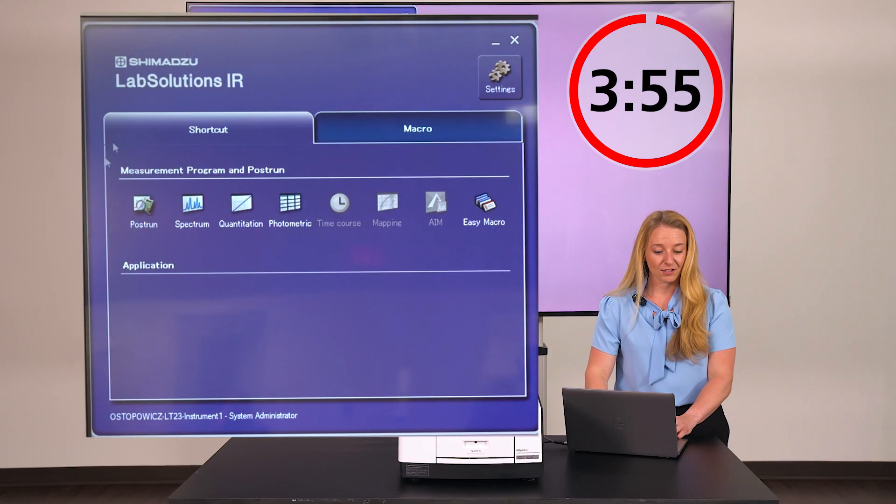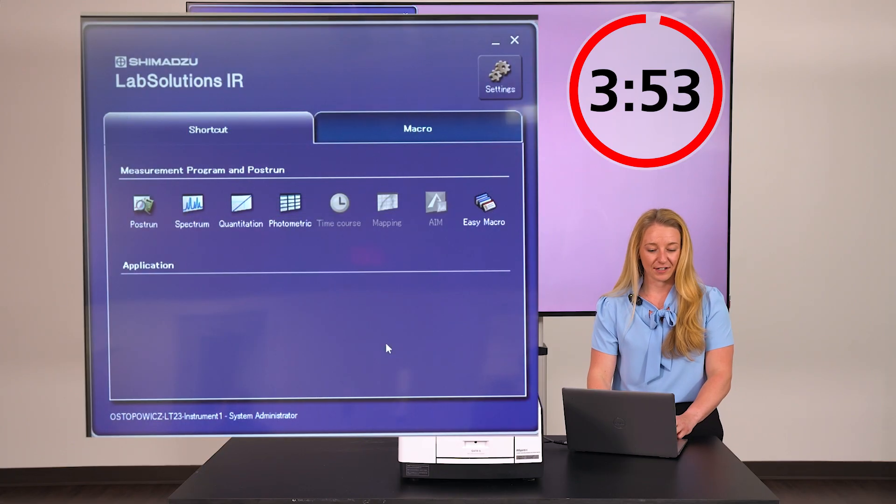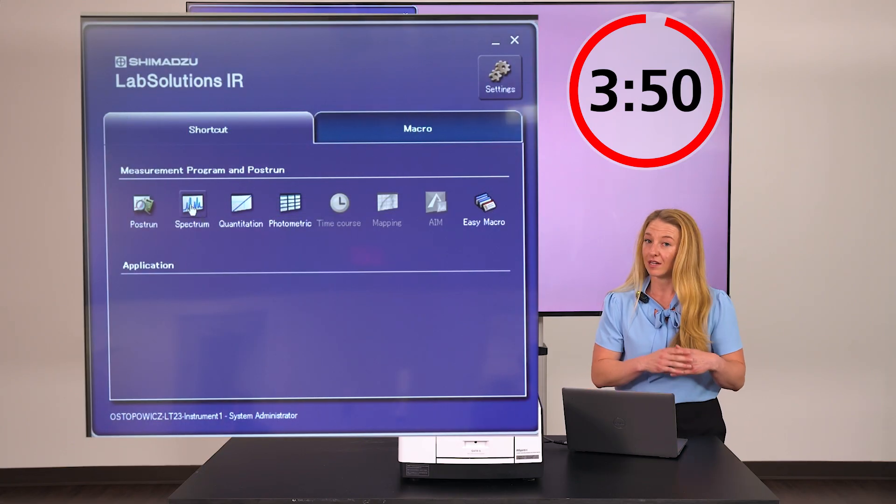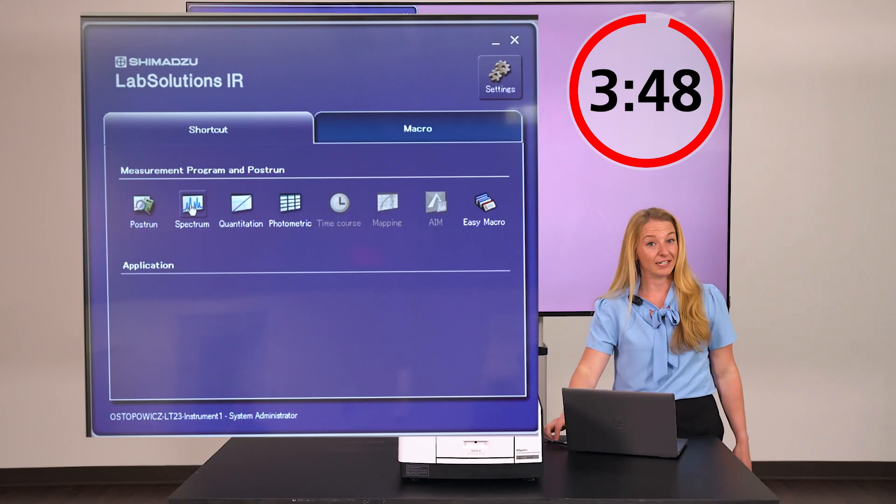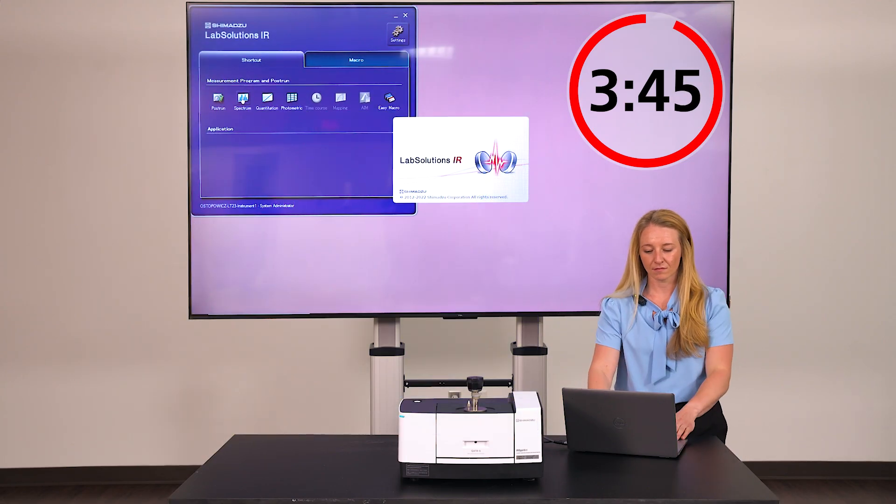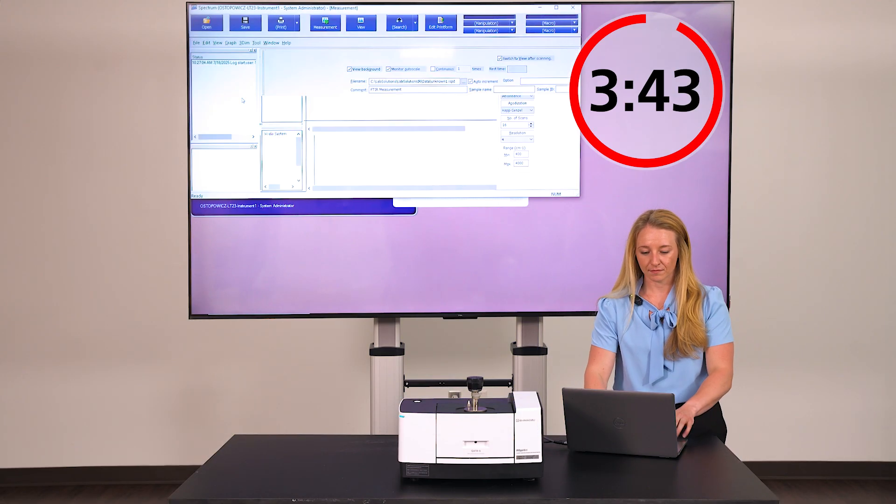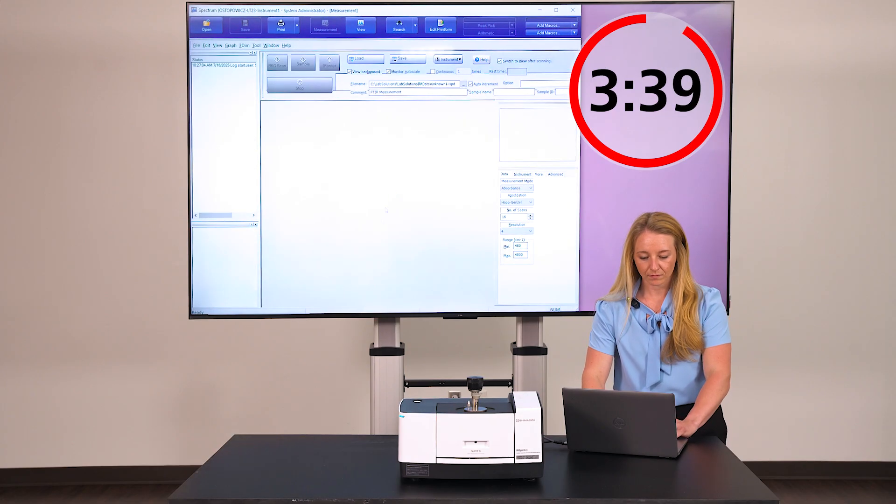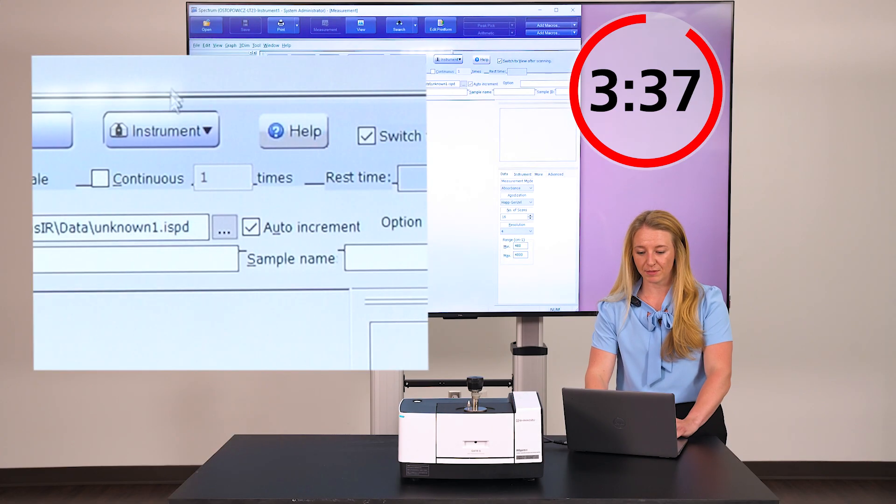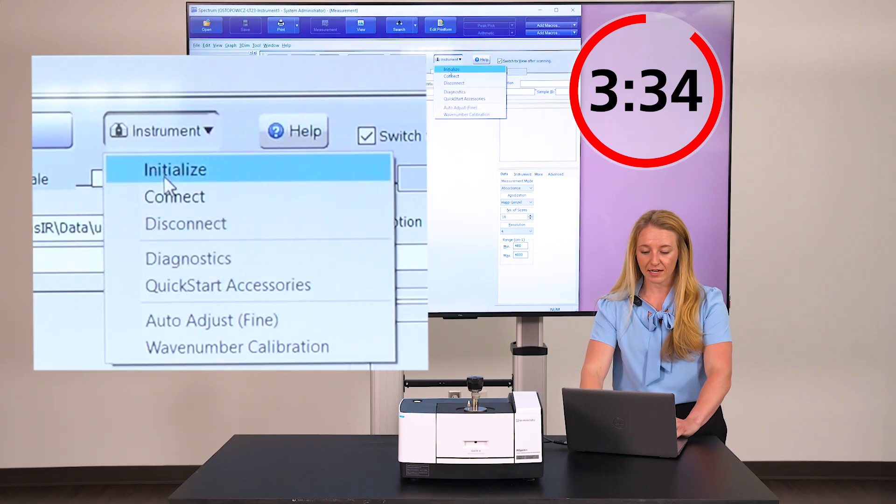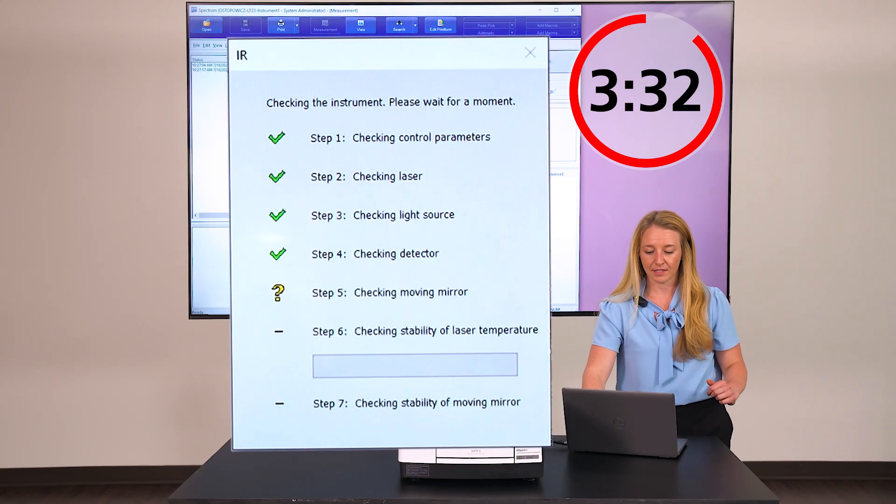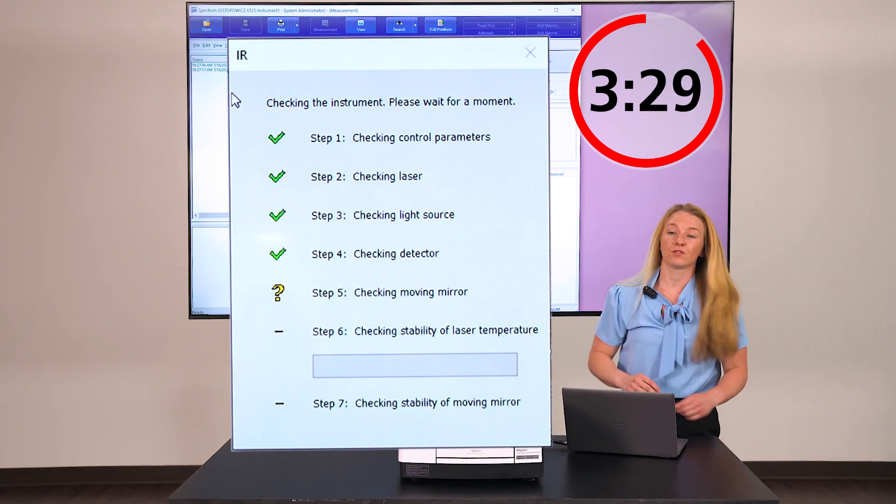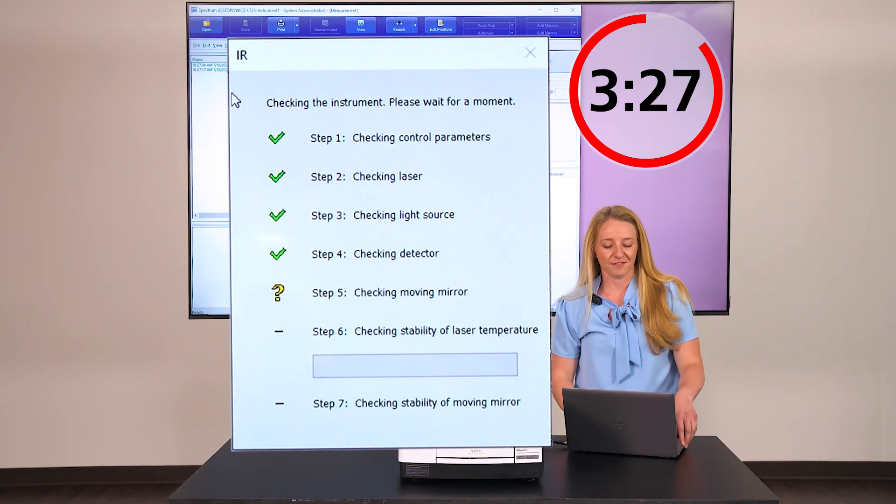I have the Lab Solutions IR Launch Pad already open, and I'm going to select Spectrum because I want to collect an entire spectrum to identify our sample. I next need to establish communication between the hardware and the software, and that's done by initializing the unit. It goes through a series of checks to make sure that your Spirit is ready to run.